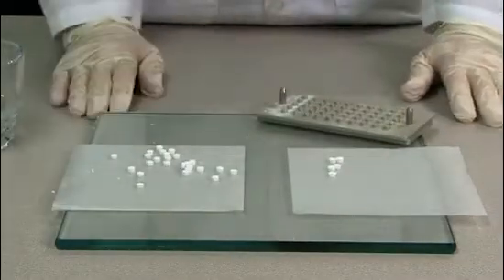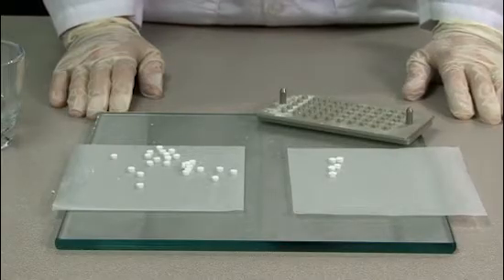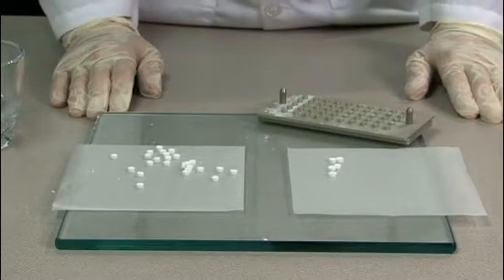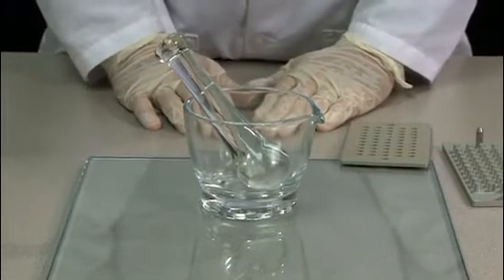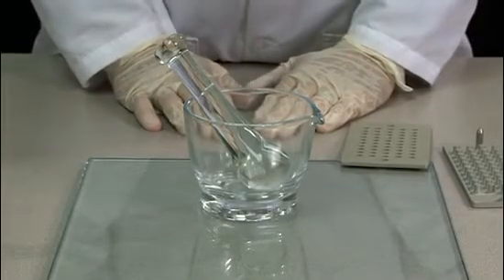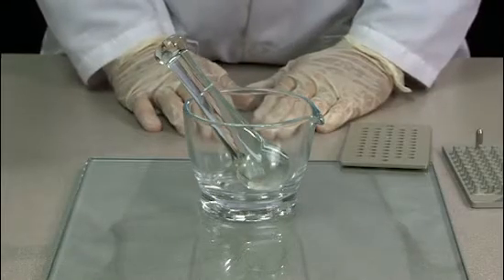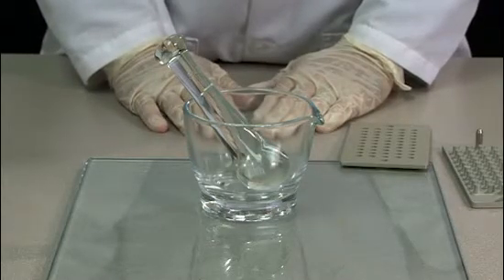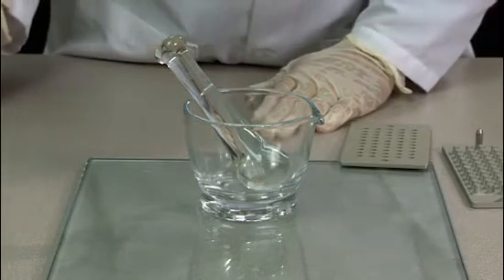The average weight of each kind of tablet is then determined, and the percentage of the cavity in the cavity plate occupied by the active drug is determined. Again, refer to your formulation record. A tablet triturate in general is sucrose and lactose. The amount of sucrose will depend on the drug that is being used. Its purpose is to add firmness or hardness to the tablet. The lactose acts as a diluent and a bulking agent and will depend on how much drug is being added and how much sucrose is needed for the desired tablet hardness.